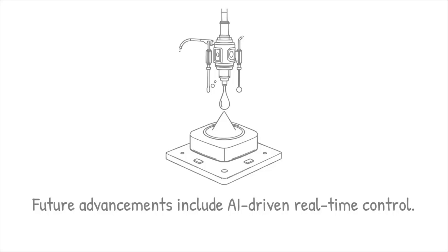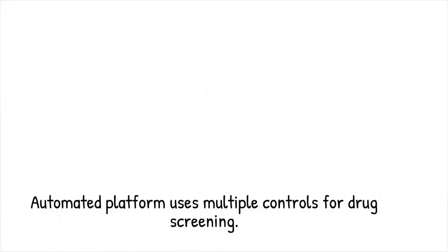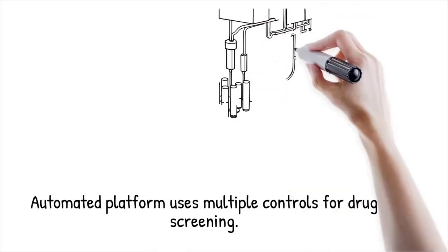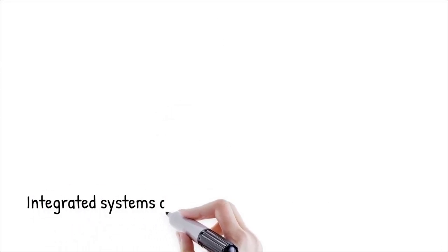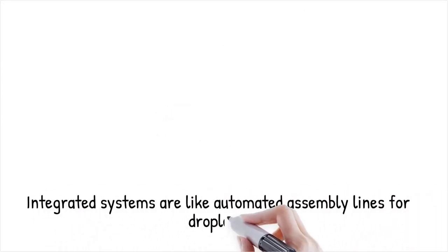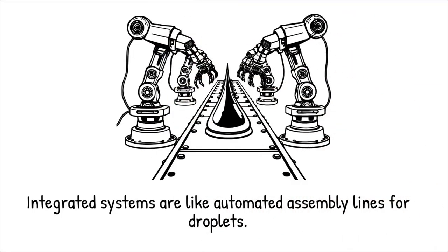An integrated microfluidic platform uses magnetic control for droplet sorting and optical methods for merging droplets in an automated drug screening assay. Integrated droplet systems are like a fully automated assembly line where different robotic arms perform specialized tasks in perfect coordination.